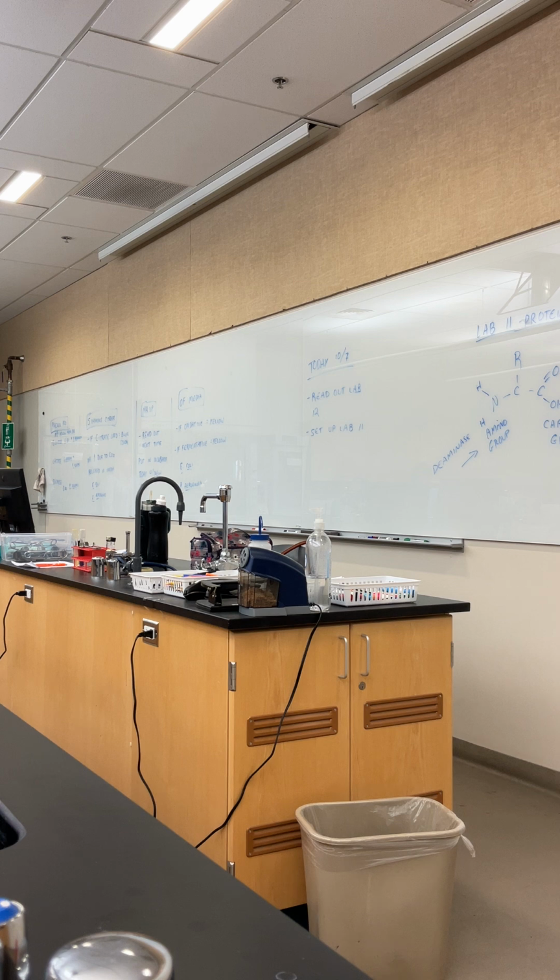Phenol red tubes are going to have the Durham tube inside. So one of the first things we want to do is look to see if we see a gas bubble. The reason is, if we see a gas bubble, even if we don't see a color change, that indicates that the carb is being broken down.